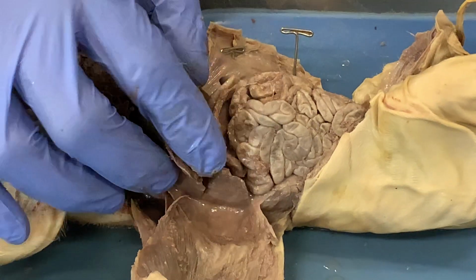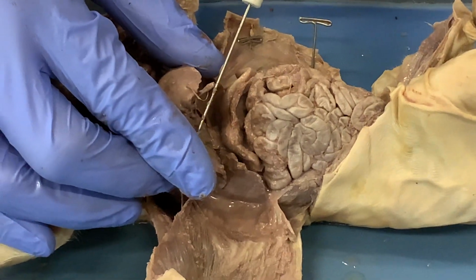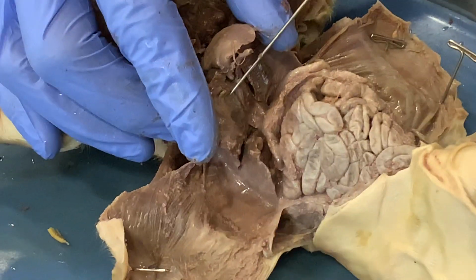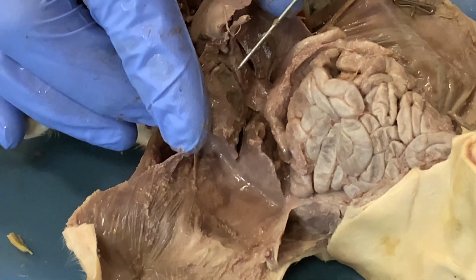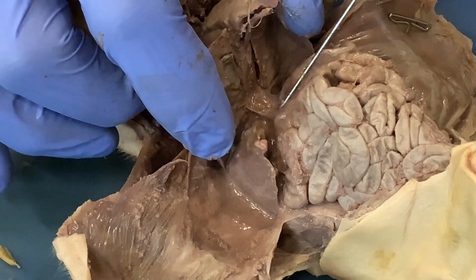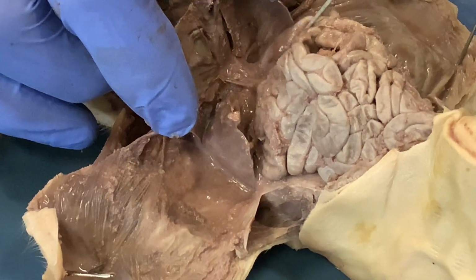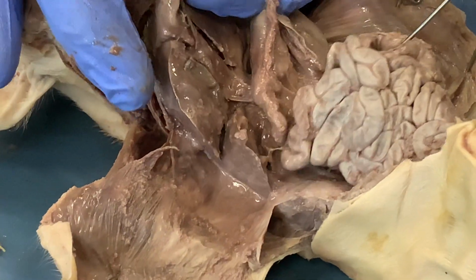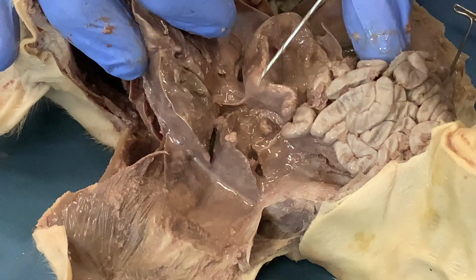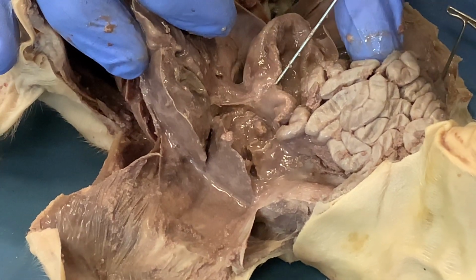On the back of our liver, there's a gallbladder right here as well. It's not very inflated on this particular pig. And it connects down here through the bile duct to the junction of the stomach and small intestine right here.